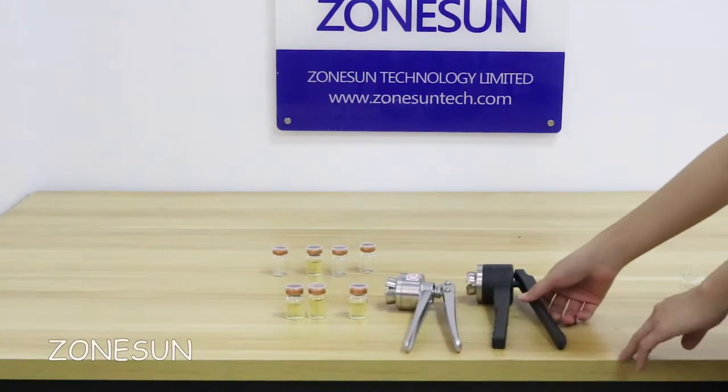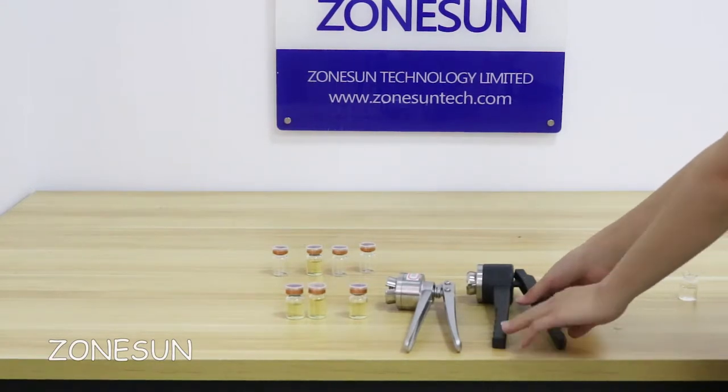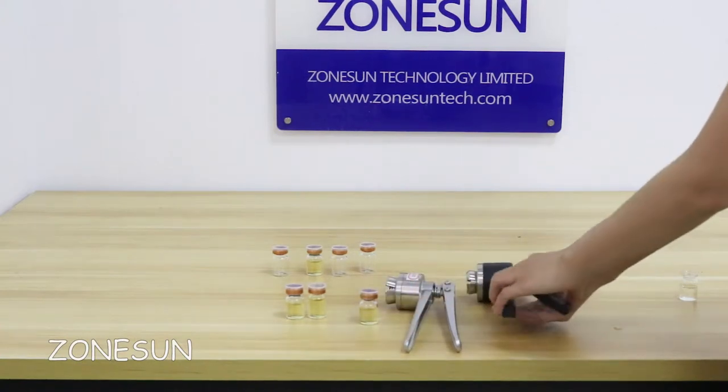Hi, welcome from Zhongshu. Today I will introduce how to use the biocaffeine tool.